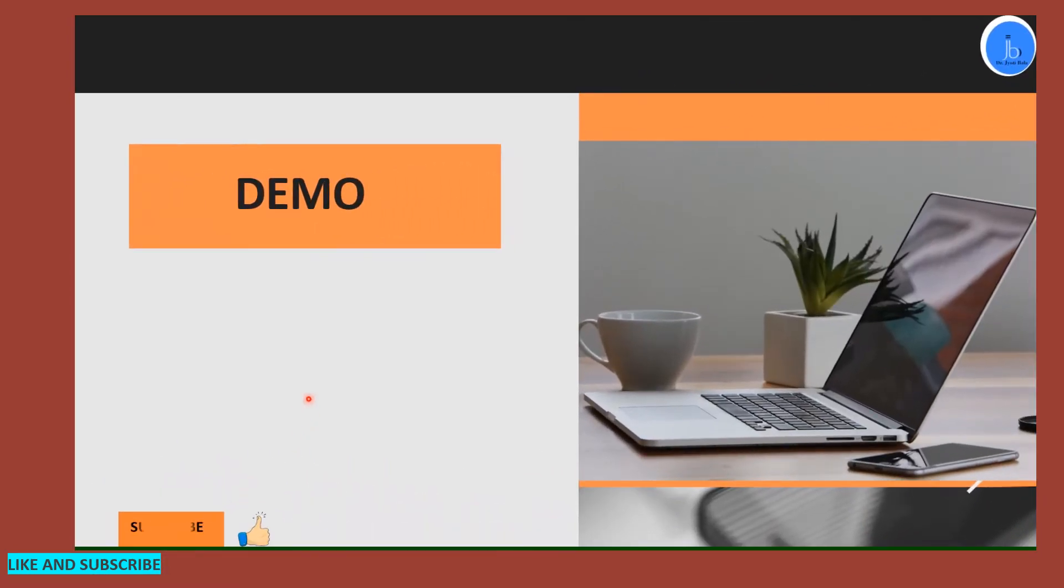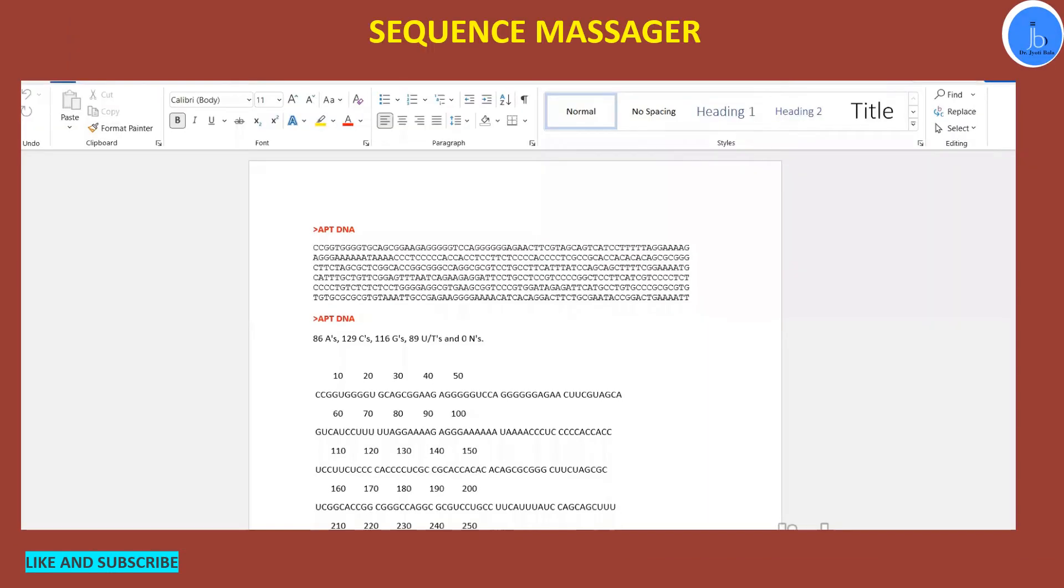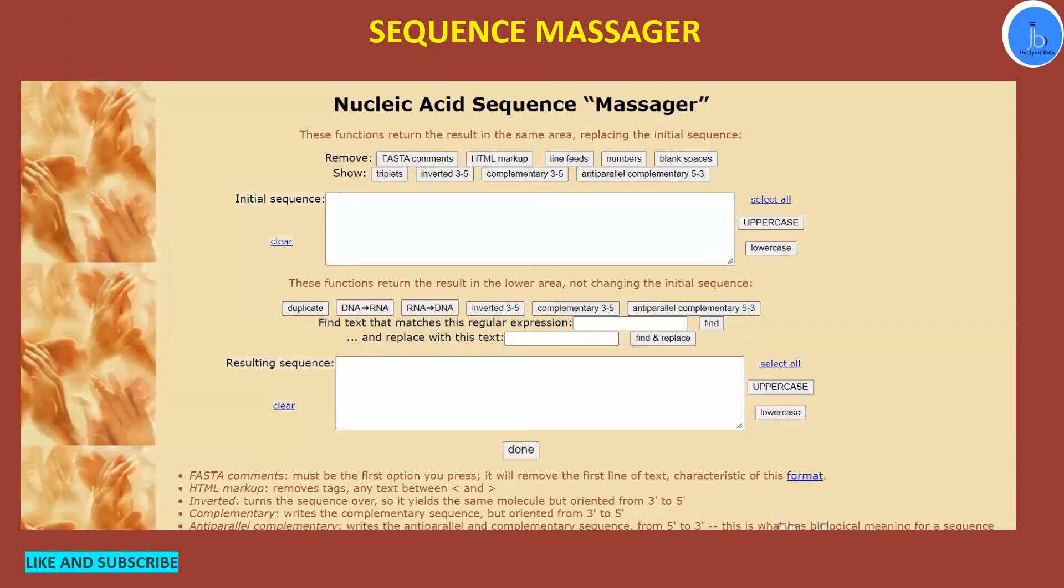So let's perform one demo over here. I will be showing you how you can perform these simple tasks. So let's go to that page. This is the Sequence Massager page. When you open this page, you will find several options over here.